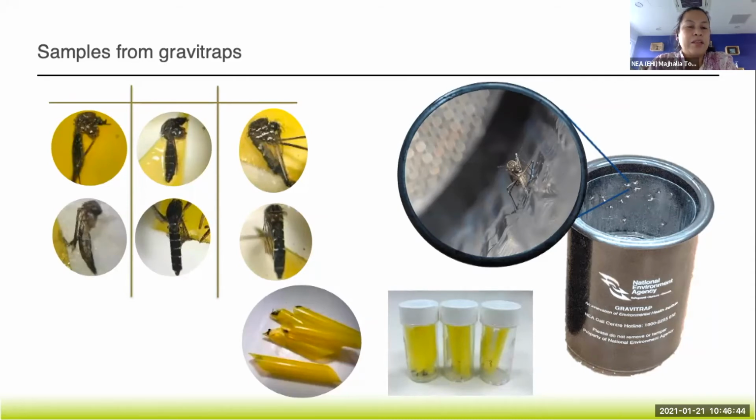The middle one is actually Aedes albopictus. You can see that the basal bands on the tergites are complete. And if you look closely, you can see the V-shaped mesepimeral white scales on the thorax. Okay, yes, it has complete bands on the abdomen.